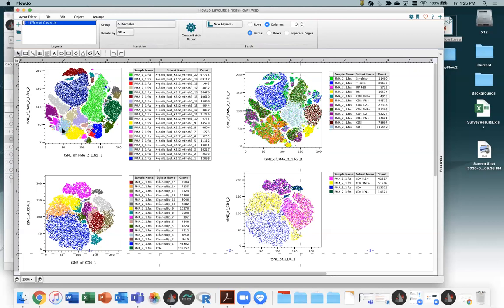Again, feel free to always argue, but the t-SNE plot is showing that there are these main populations, and the X-shift algorithm, which was not shown the t-SNE parameters, generally finds what look like the islands in t-SNE as their own separate populations. There's one down here that's red, gray, and blue that X-shift thought maybe had more complexity in there than the t-SNE algorithm is able to find, but overall it looks like a fairly reasonable clustering result.